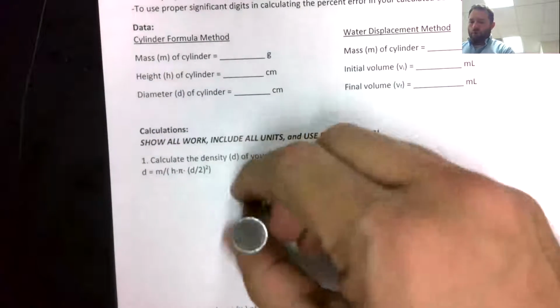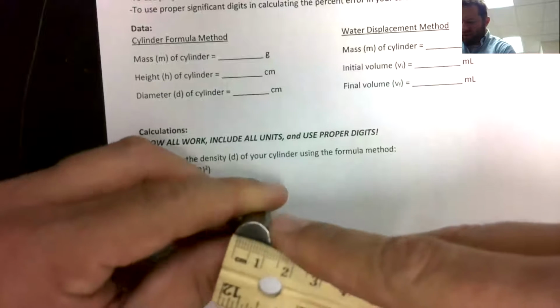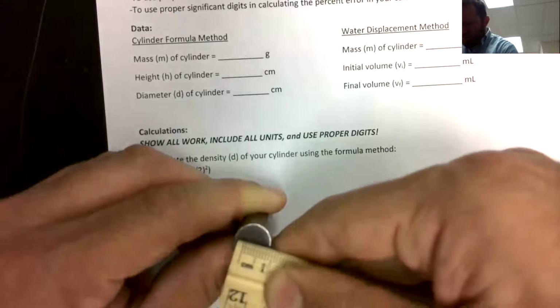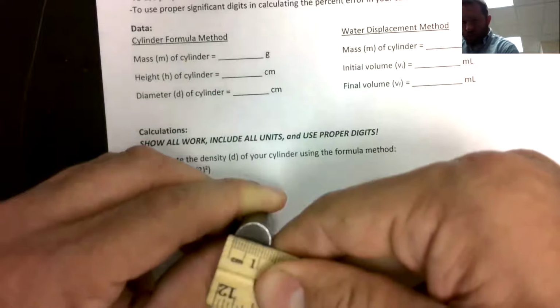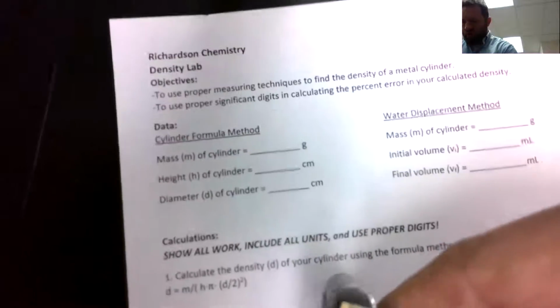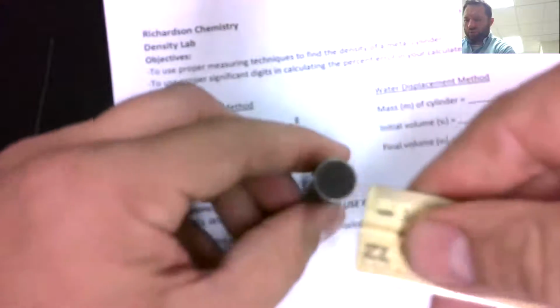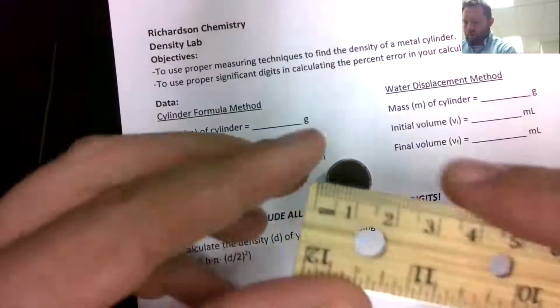Next up, we'll go ahead and record the diameter. Now, this may not be a perfect measurement. It's hard to find the exact center. We'll do the best that we can. Okay, so I think I've got it on the edge, and it's going over to the other edge. I'll zoom in here real quick. Most precise possible.